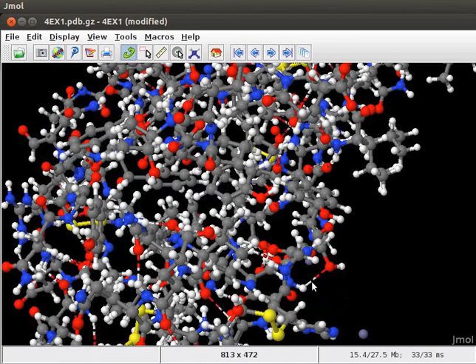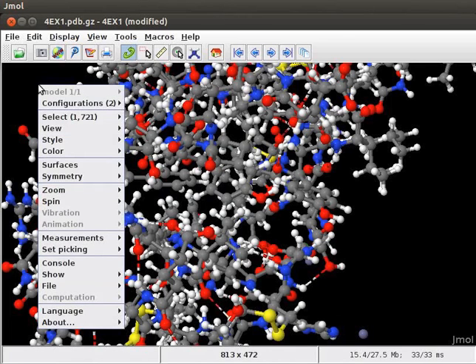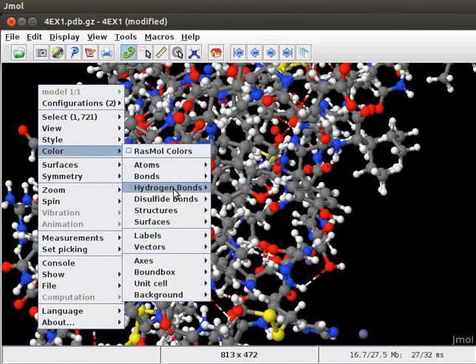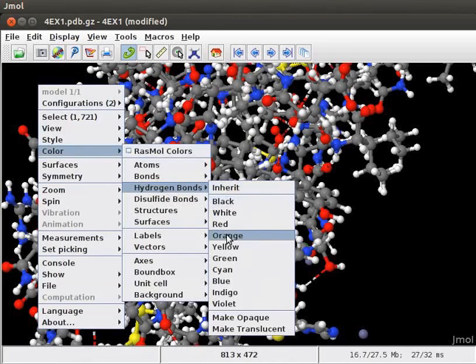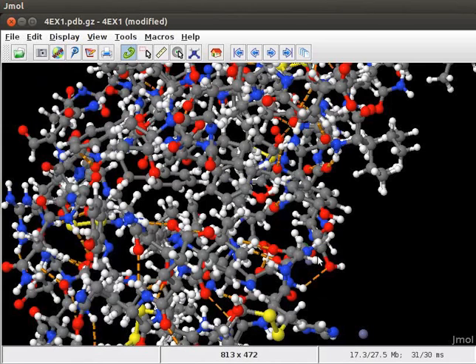We can also change the color of Hydrogen bonds. From the pop-up menu, scroll down to Color, then Hydrogen bonds, then click on Orange option. On the panel, we have all the Hydrogen bonds in orange color.